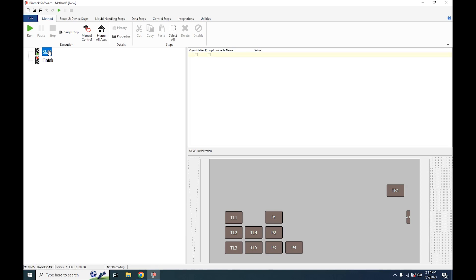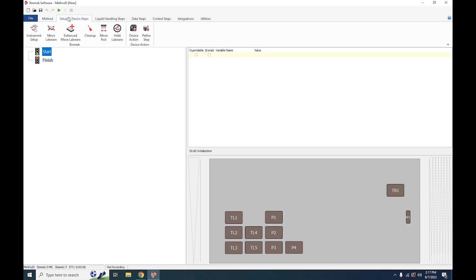Your entire method will need to happen between the green light start and the red light finish. The first thing we're going to need to do is define the deck. To do that, we're going to go over to our Setup and Devices Steps tab and then click Instrument Setup.